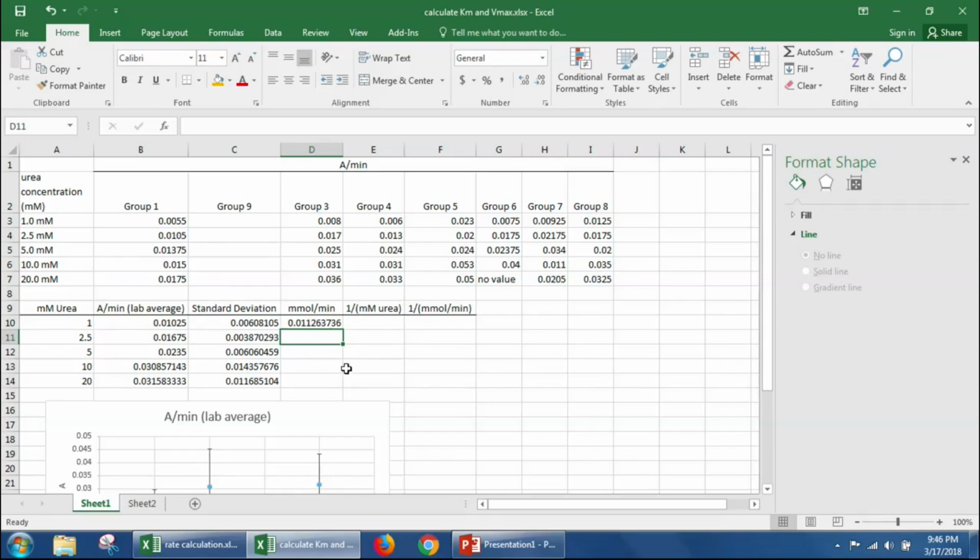But we're not actually finished. We have one more thing we have to do. We have to figure in our dilutions, right? So we did a 1:3 dilution. I'm going to put a parenthesis around that equation. We did a 1:3 dilution where we took only 100 microliters of your 300 microliter stock. So we'll multiply that by 3.